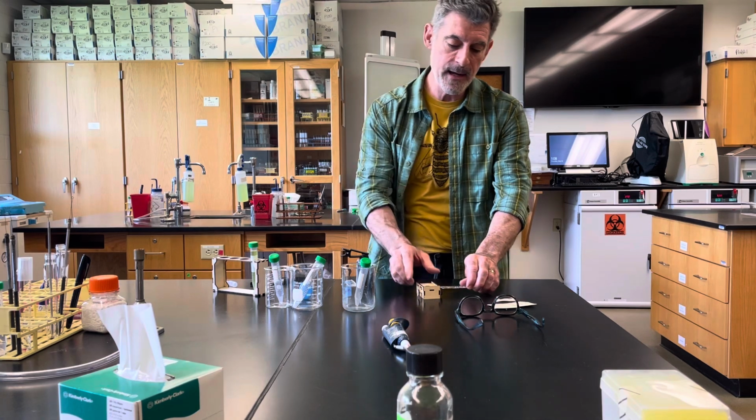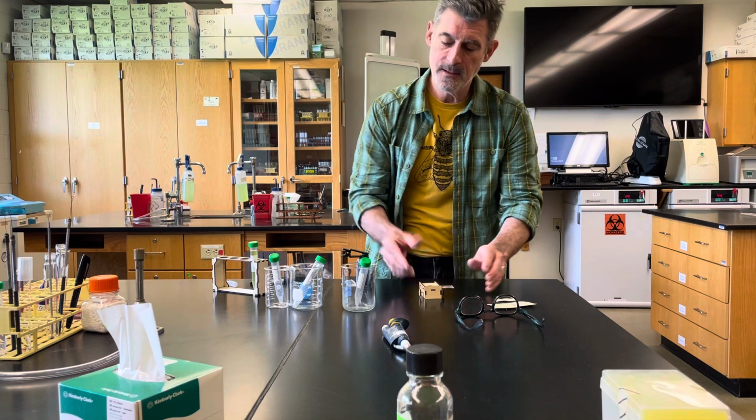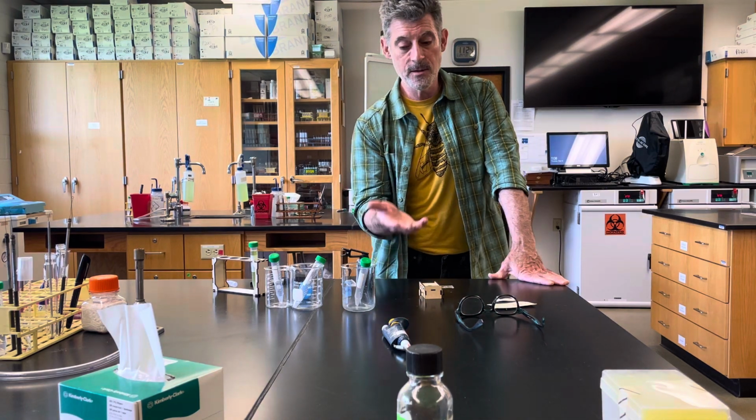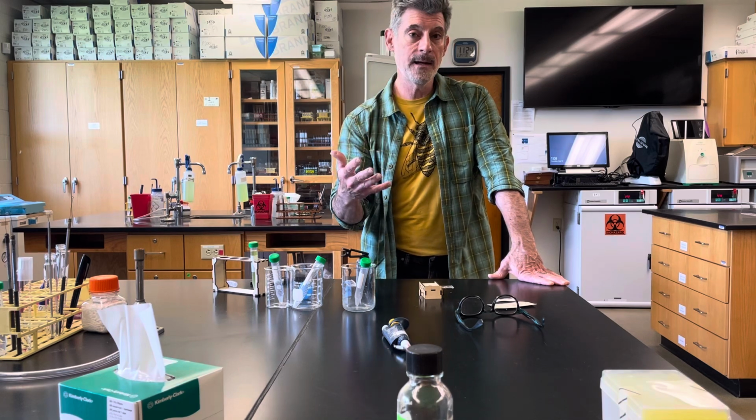All right, so what I'm going to do now is I'm going to get the camera, I'm going to attach it here, and I'm going to take some pictures of these actual live cells, the same ones you're going to see, so you know what the cells look like.